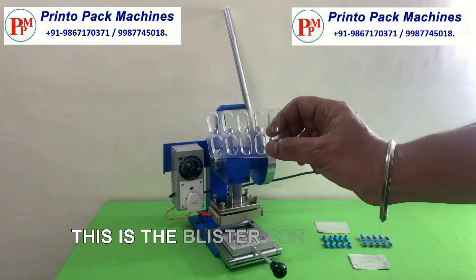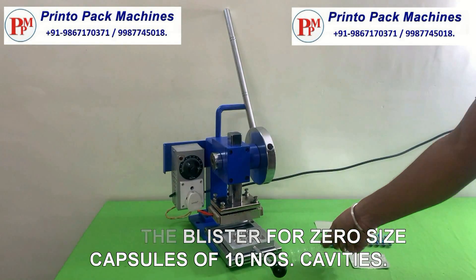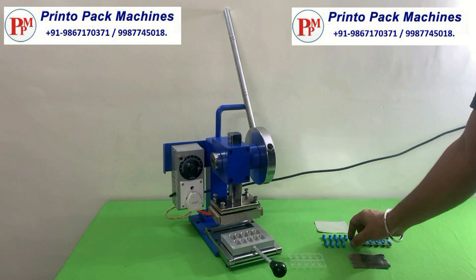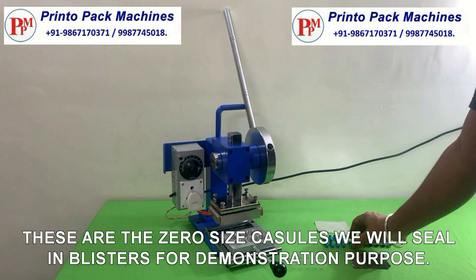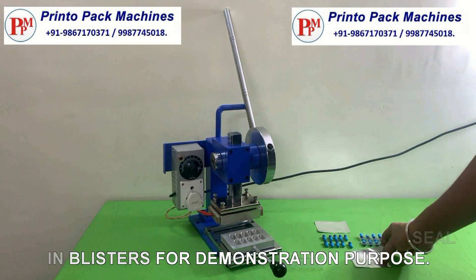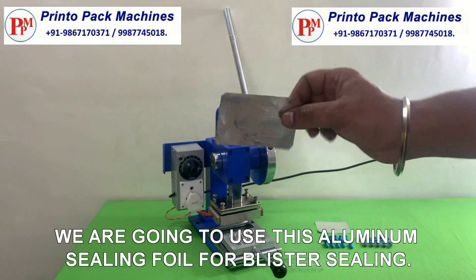This is the blister for zero size capsules of 10 numbers cavities. These are the zero size capsules we will seal in blisters for demonstration purpose. We are going to use this aluminum sealing foil for blister sealing.